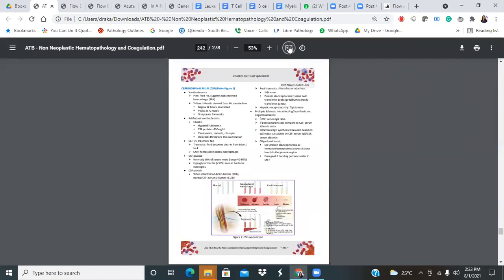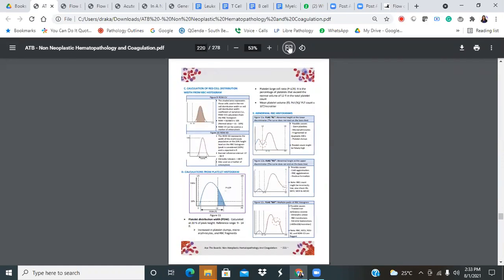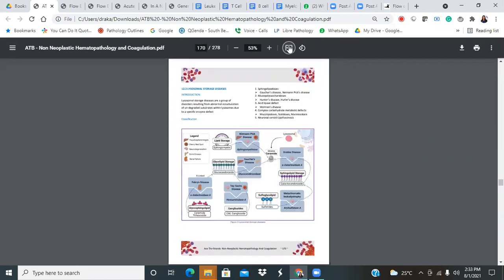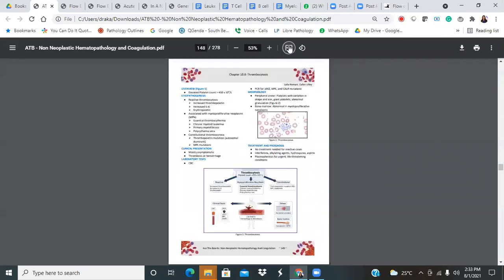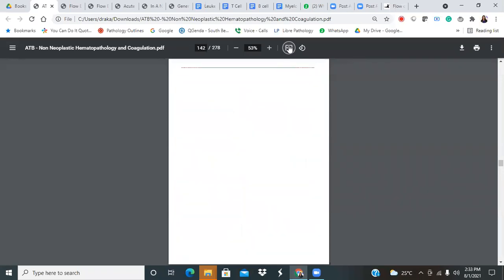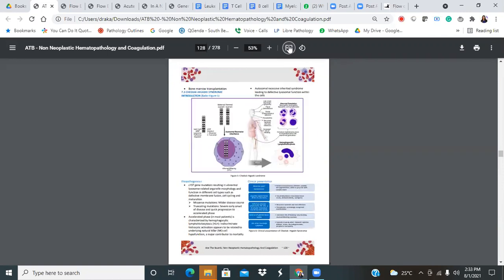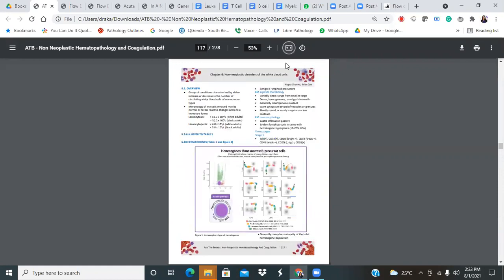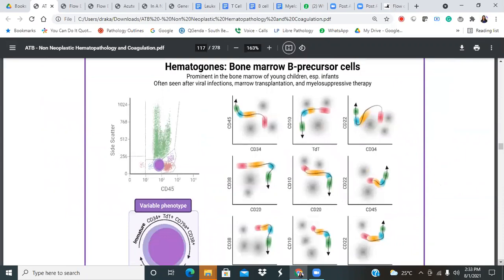So what they are saying, let me read your question again, apparent positivity for low emission wavelength fluorochromes, which means the cells should not ideally be positive for a certain marker. For example, eosinophils should not be positive for CD19. But if they show a slight positivity, it's not because of the antigen or antibody itself, it is because of their granules, which have autofluorescence. CD19 is just a wild example. I'm just saying the concept is that it sometimes has some positivity where it should not, because of its autofluorescence. Yeah, that's a very important concept to remember.